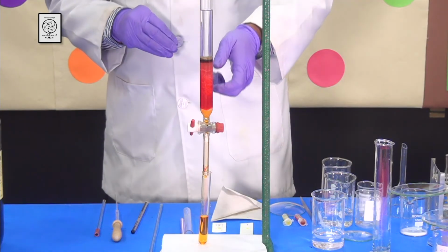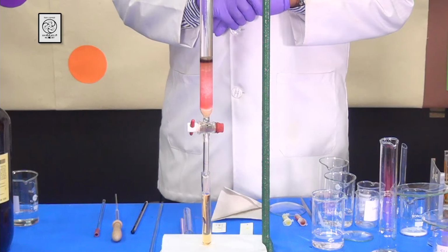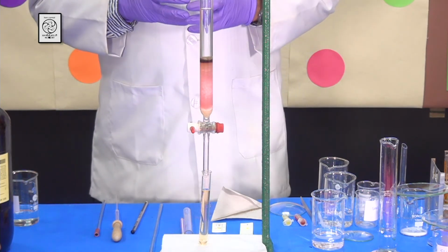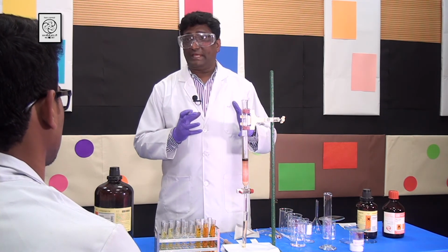The red compound appears dark yellow because it is in dilute solution. Students, now we can see that even the red compound is completely eluted. Now, the column is finished. I am going to close the stopcock. Now, students, we have completely eluted both the components of the mixture, which we call eluates.